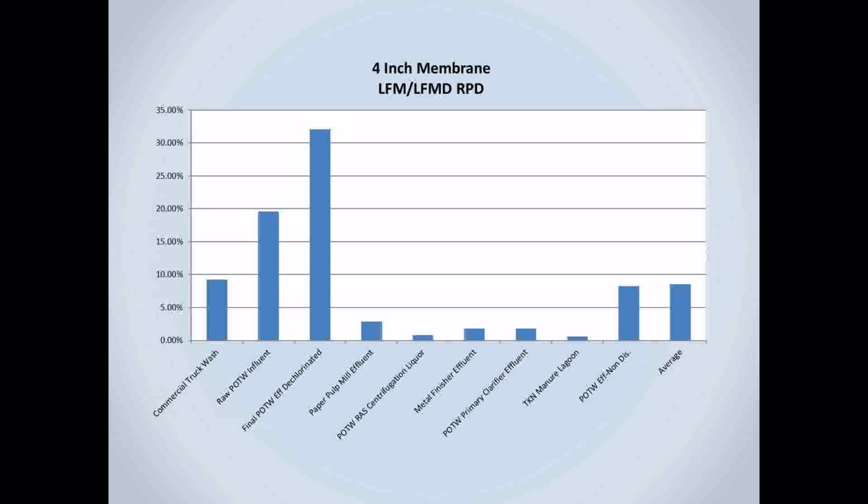But here's the thing. If your matrix spike and your matrix spike duplicate meet the QC requirements of the method, then you don't have to worry about this one. But again, in developing this method, we do have some outliers. We did not get rid of any of the warts. All this has been put together, warts and all. It's a very robust method.